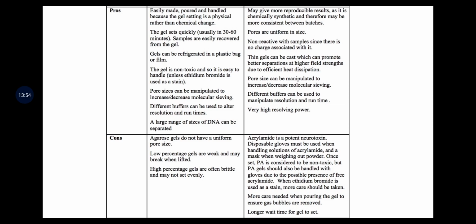The gel is non-toxic, so it is easy to handle. Pore size can be manipulated to increase or decrease the molecular sieving. Different buffers can be used to alter the resolution and runtime. A large range of size of DNA can be separated.